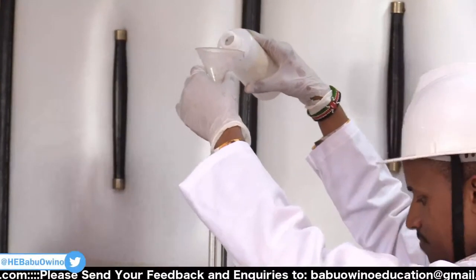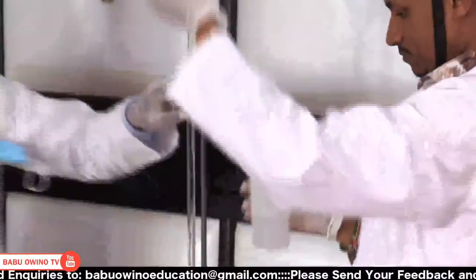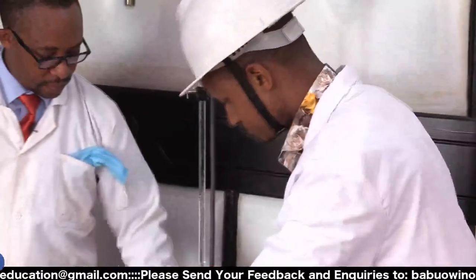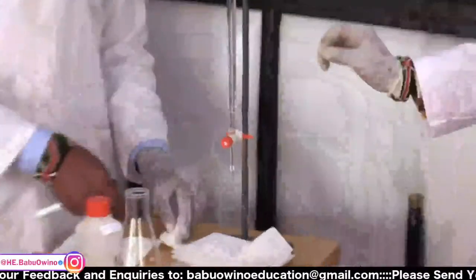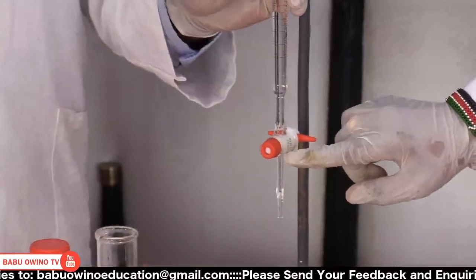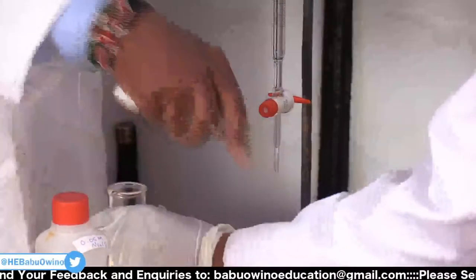So you lift the funnel slightly up so that you allow the atmospheric pressure to fill it. Then after that, you release, because as we can see, we have our burette. Then this burette is filled up to this level where the tap is. Then you release some of the titrant, which is inside the burette. You release it a little bit so that you fill the whole burette. So I will release it here.